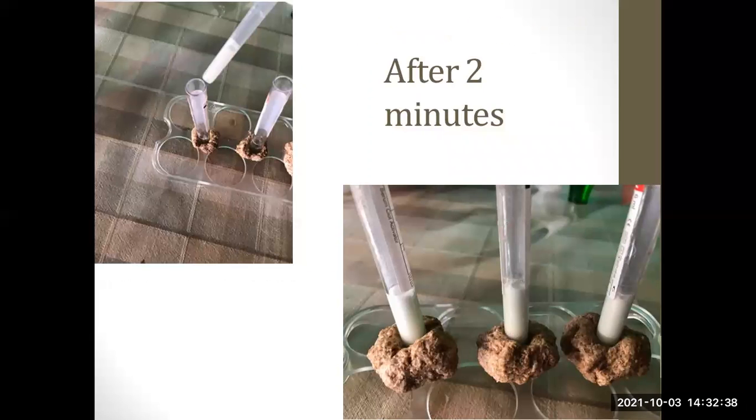And we follow the same steps. We added the peroxide solution first, then we had the timer prepared, and then we added the yeast solution, swirled them a little bit, and after 2 minutes, this was the foam. And as you notice, it didn't go up very high. I will explain a little why this happened.